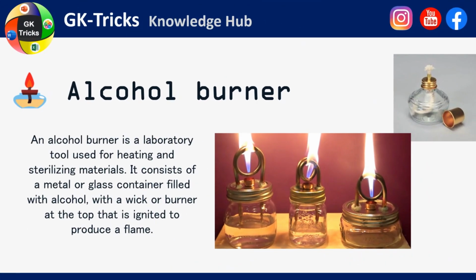Alcohol burner. An alcohol burner is a laboratory tool used for heating and sterilizing materials. It consists of a metal or glass container filled with alcohol, with a wick or burner at the top that is ignited to produce a flame.